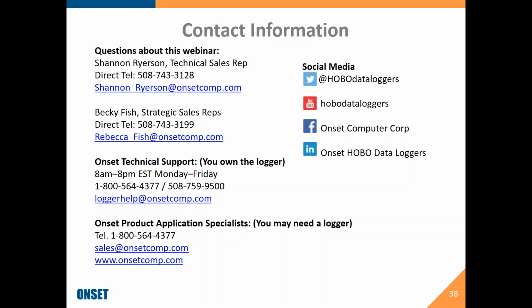Is there a waterproof shuttle, a wireless method to extract the data from the loggers? Okay, so the waterproof shuttle is the option that would be required with our Optic to USB data loggers. So if you're using one of the original water temperature loggers, the DO logger, or the conductivity salinity logger, or the U20 or U20L water level logger, those all require an Optic to USB communication device in the way of a base station or a data shuttle. You do not need both. We strongly recommend the data shuttle pretty much for all of our water quality data loggers.